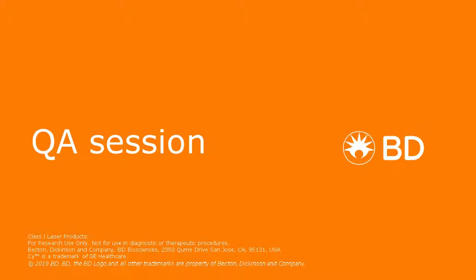All right, great, thank you. One question related to equipment: can this panel be prepared and used on a FACSLyric system? That's another great question. Just to clarify, the FACSLyric is a 3-laser, up to 12 parameter instrument. So the exact panels that we showcase here, the 12 color or the 18 color panels, cannot be utilized on the Lyric just because of the different configuration and the lack of a yellow-green or a UV laser.